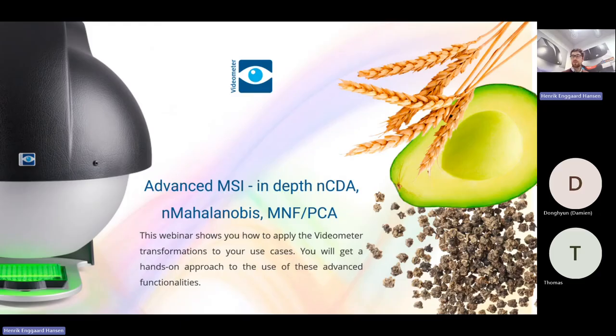And finally, I'll also go over some ways of getting the most out of your transformations, what kind of tips and tricks there are to set them up, how to analyze the output of the data, and how to really get the best results. I want to note that today we'll be using the new transformation builder, but there's also the old transformation builder that's still available in our software, and many of the methods still apply equally well.